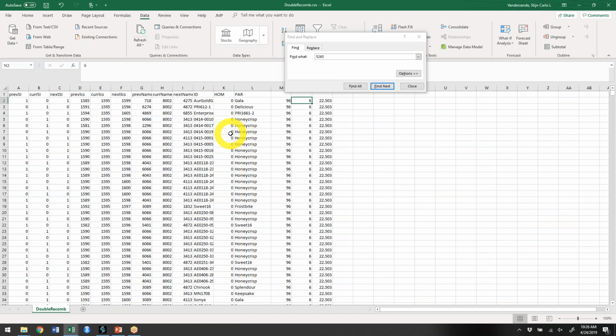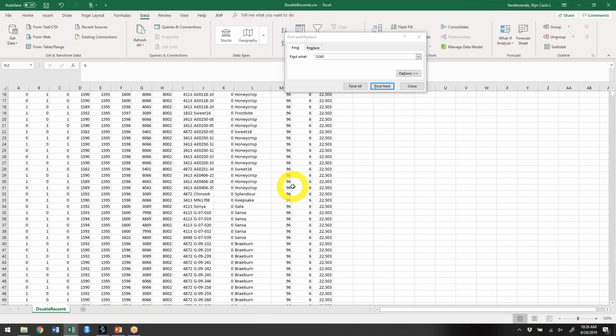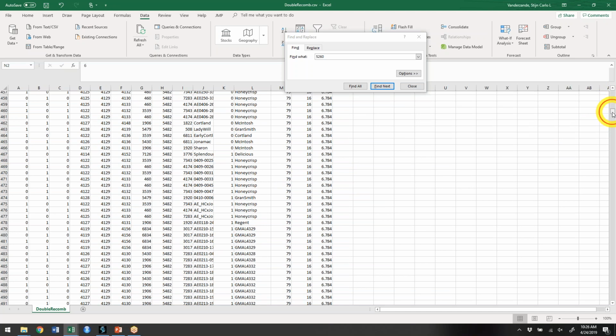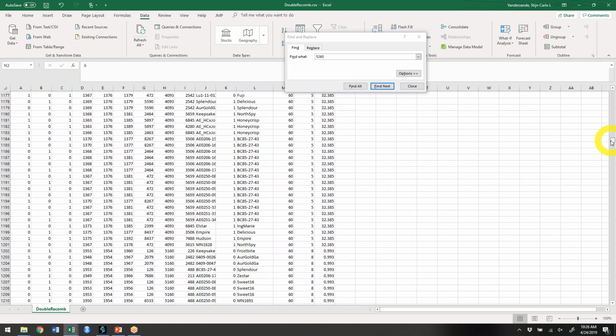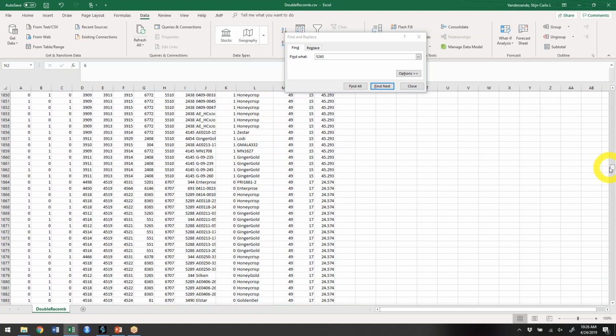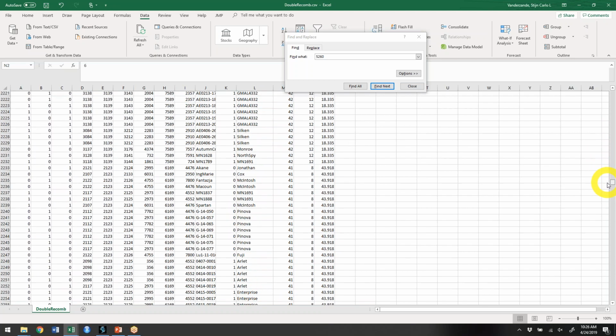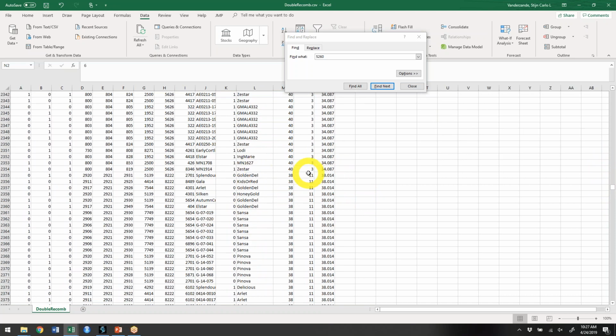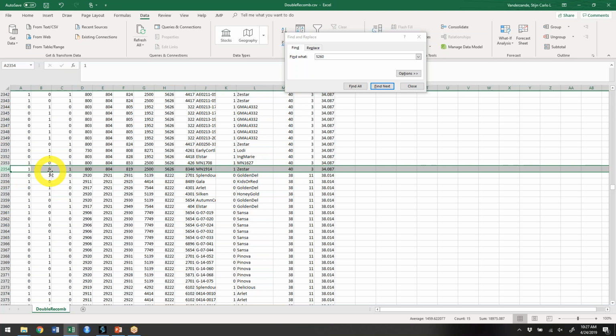So what you would be doing here, at least for the ones that occur a lot in the data set, is just solve these singletons first. It depends a bit on how big your data set is, but anything that occurs up to 50, maybe 40, just have a look at those. And after you've done all the ones that occur at least 40, maybe you could take a break. If you do that, you would have solved about half of the singletons that are reported.